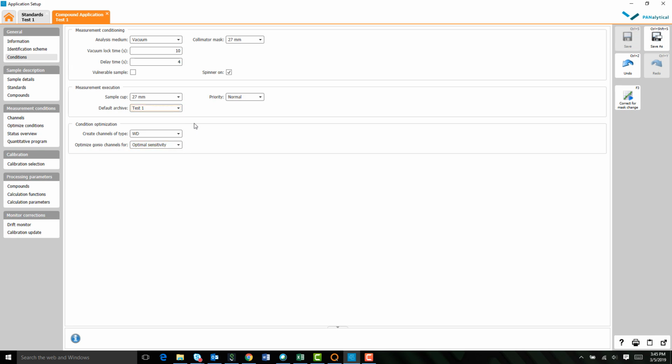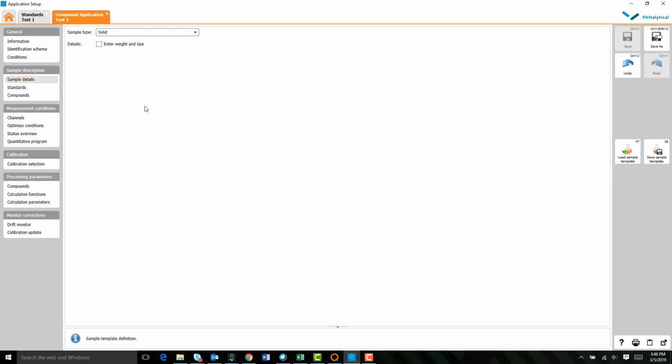That's okay. But I do not recommend that, because if you do and your archive becomes corrupt, it means that you lose all the data for all applications rather than losing data for only one application, if that's what's going to happen and you don't have a backup. So let's keep it as the name of the application, and all the data that's run will be saved in this archive.